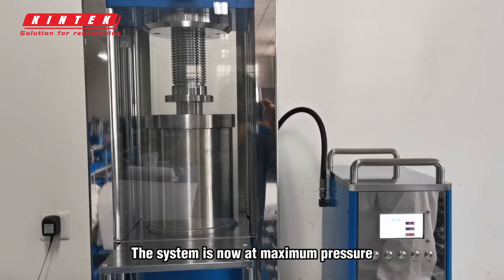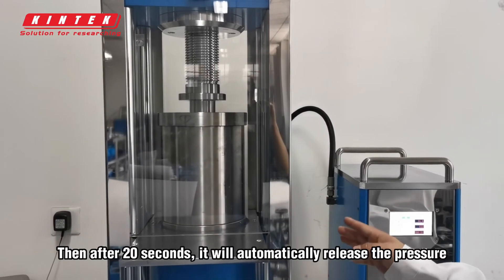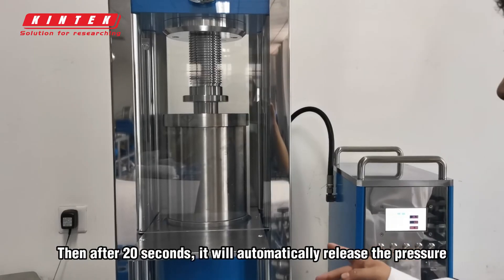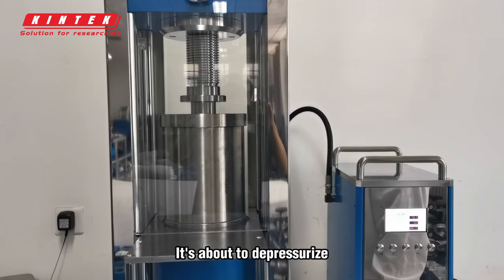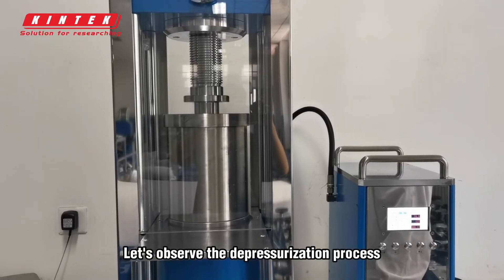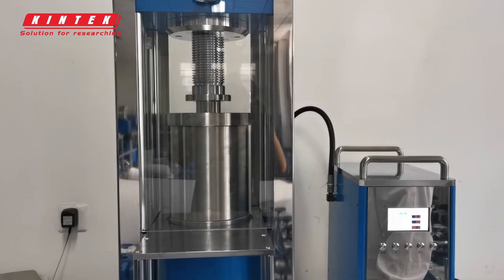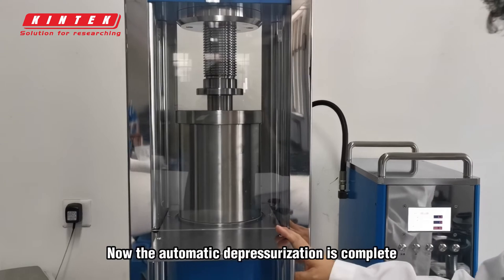The system is now at maximum pressure. Then after 20 seconds, it will automatically release the pressure. Counting now — 8 seconds have passed. It's about to depressurize. Let's observe the depressurization process.